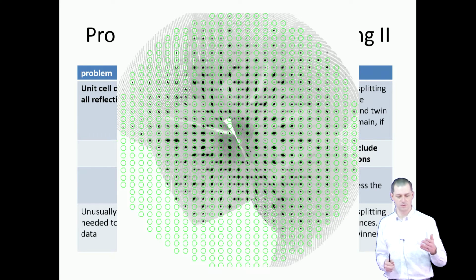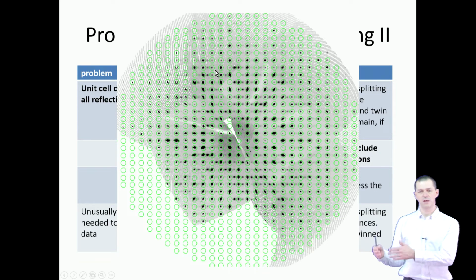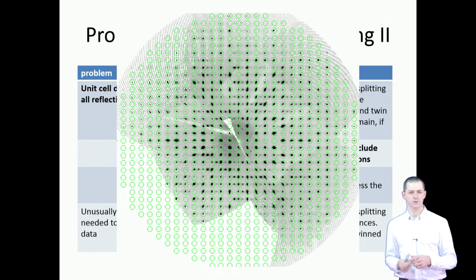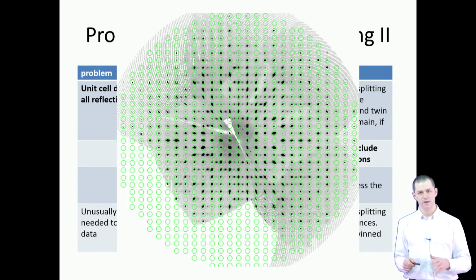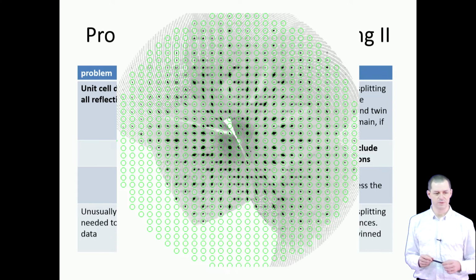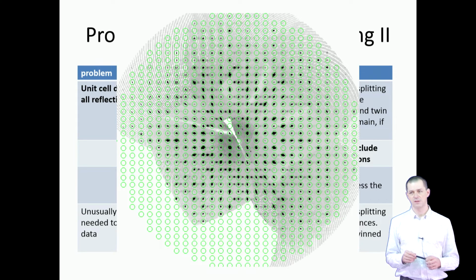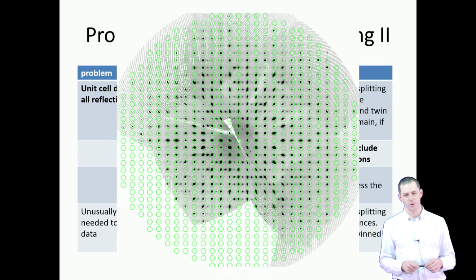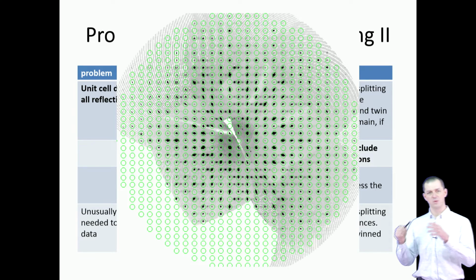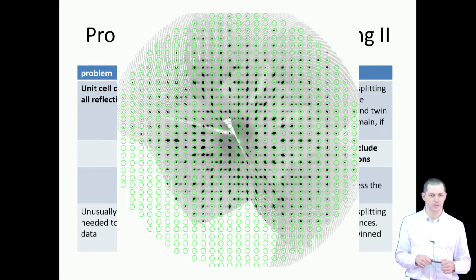So there wasn't the possibility to easily calculate pictures like this, because there were no three-dimensional diffraction data, only intensities of individual reflections. Of course, there were ways to avoid that. You could record precession diffraction images, other things, but it happened often that weak signals were missed, and in the database you then have just an average structure without the ordering that would be found if these weak additional reflections were considered in the structure determination.